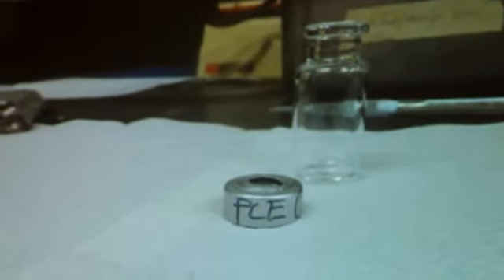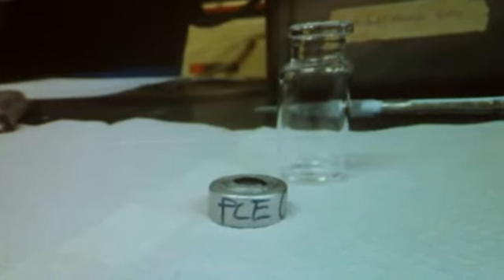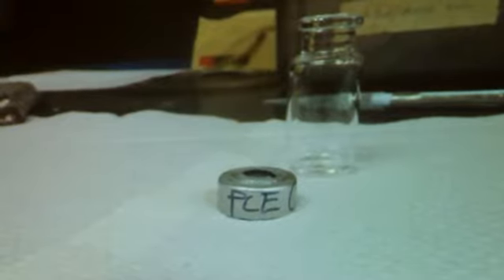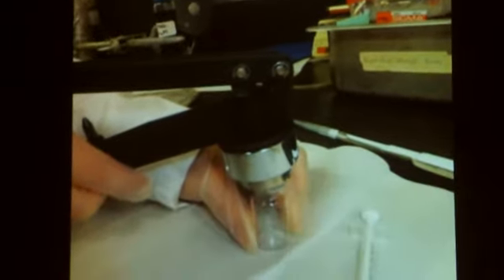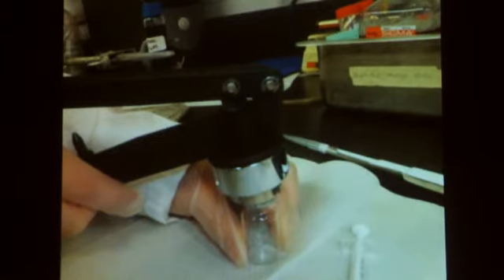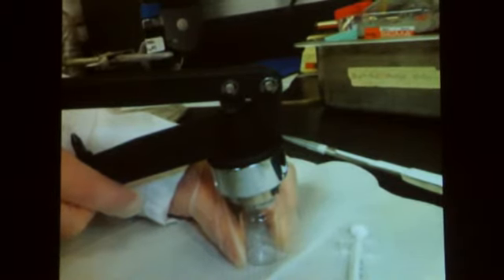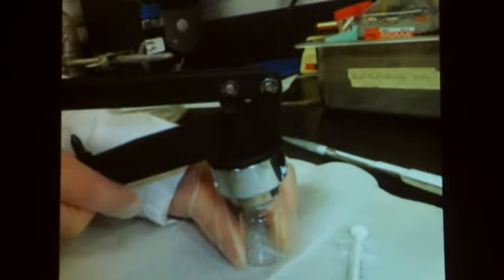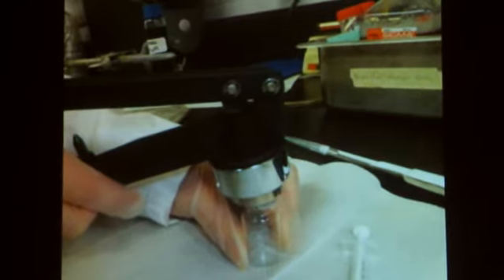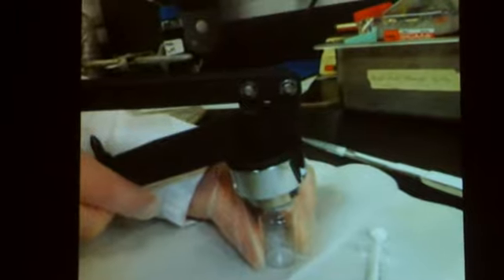Okay, and also be sure you label your vials so you don't get them mixed up. There will be 3 of them. Okay. And next part is we use a clamping tool. This part should actually be done before we suck up the titanium-3 citrate, so the vial's all ready for us to inject it into the airtight bottle. The clamp is really easy to use. It fits right over top of the lid, and you just put it on and squeeze it together, and it clamps onto the vial, and it's airtight after that.